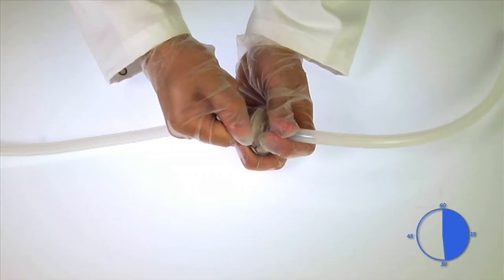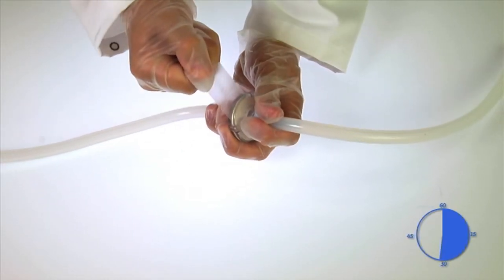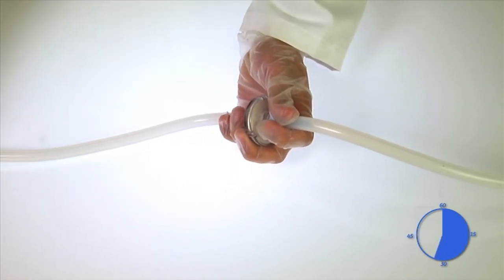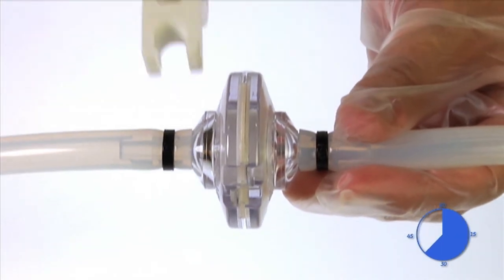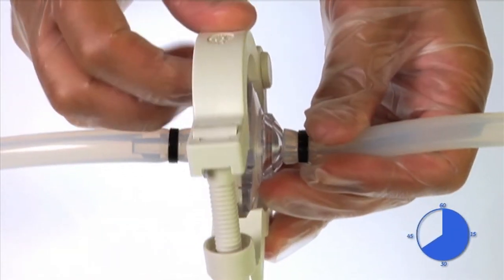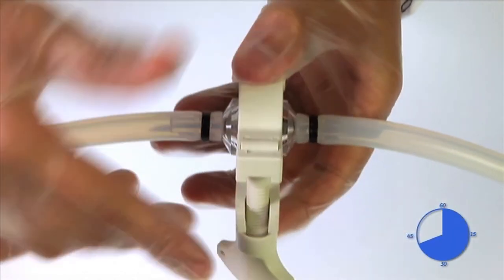Bring the tabs together. Pull firmly on both tabs. Pull straight out until the protective film is completely removed. The connection is completed by applying a standard sanitary clamp of choice.